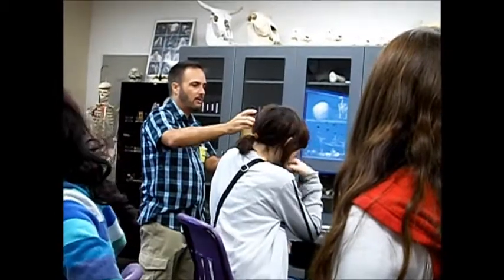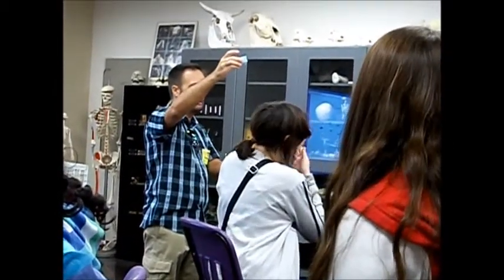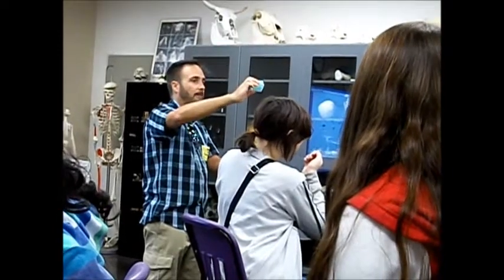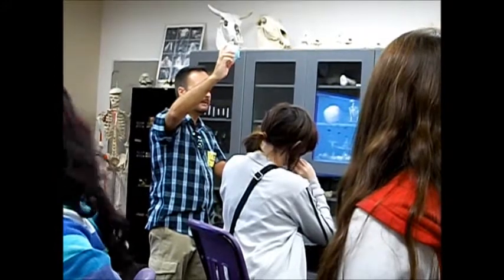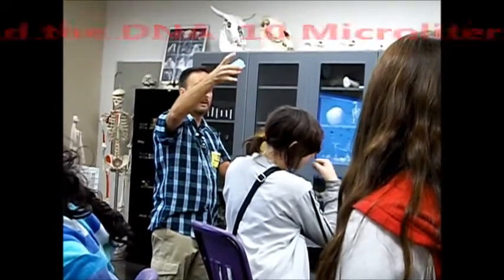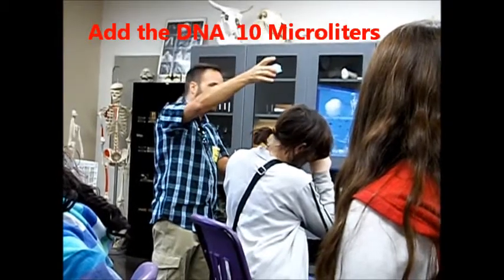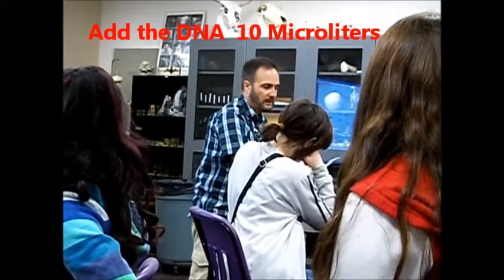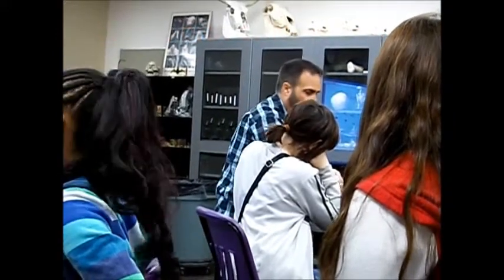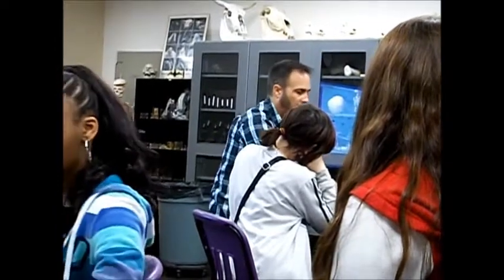Anybody know what we're going to do now? We've got two tubes that are identical at this point. What do you think we're going to do now? They're labeled plus and minus. And then what are we going to do to the plus one? Put the glowing, living antibiotic DNA in there. And so we've got it in little tiny tubes sitting on ice back there. We're going to kind of walk around with it. And you're going to put 10 microliters of the DNA into the plus tube. So you need to set your P20 on 10.